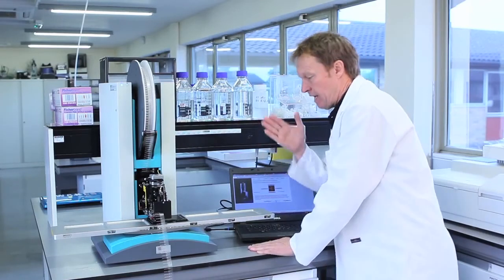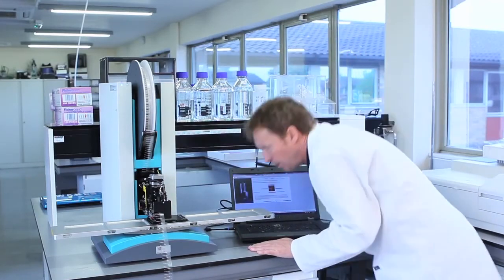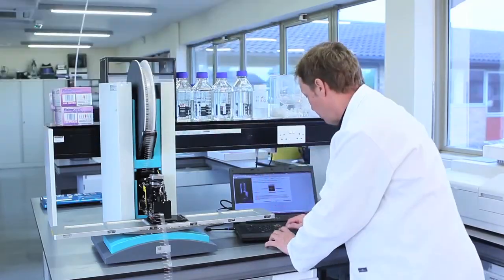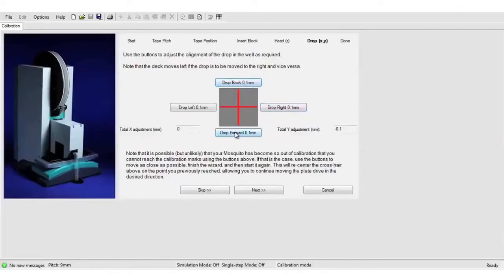The final stage is we're going to look at the X and the Y offset by looking directly down the machine in one direction. And we can move the drops forward or backwards using the cursor.